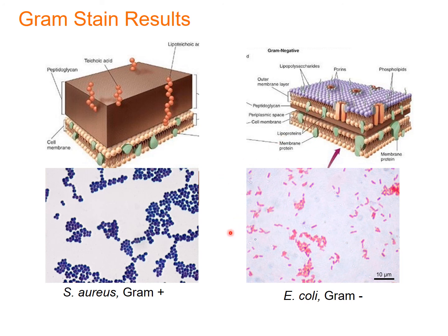This is a great technique because many pathogenic bacteria are either gram-positive or gram-negative, so a quick gram stain, which only takes a couple minutes, will help us break down and figure out which class of bacteria we might be looking at.